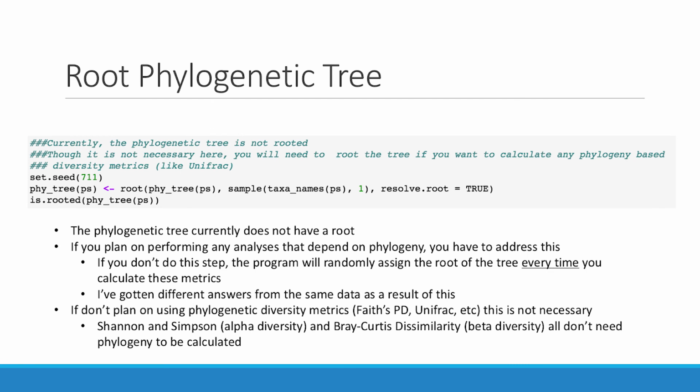One other tidbit before moving forward. The phylogenetic tree that we made currently doesn't have a root. If for some reason you don't care about phylogenetic relationships, this isn't that important. But otherwise, you absolutely need to do this before moving forward.